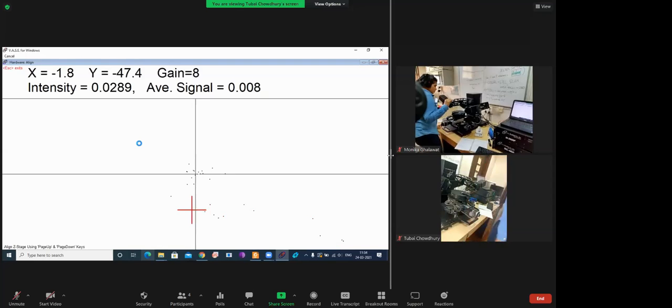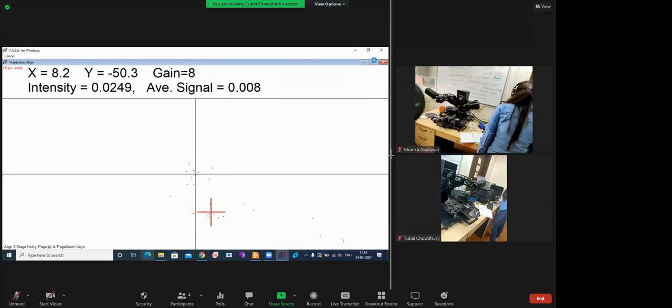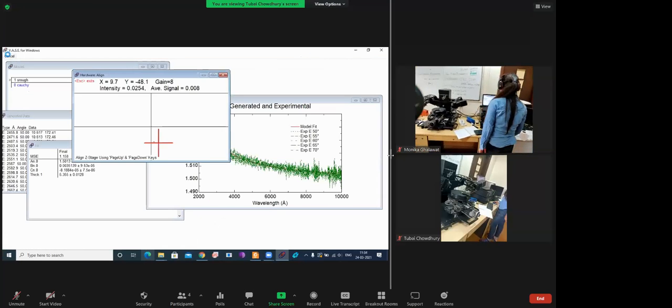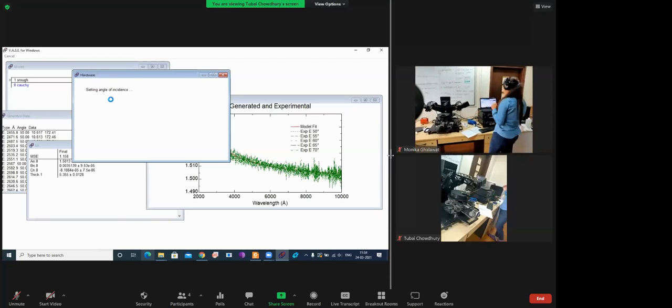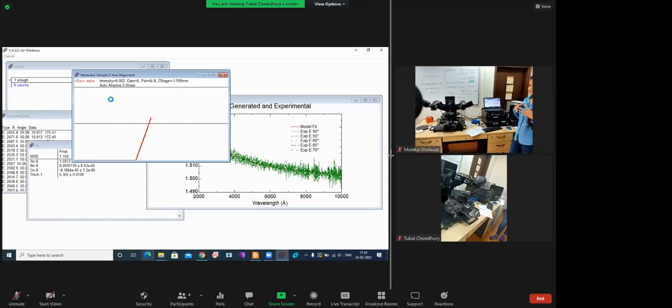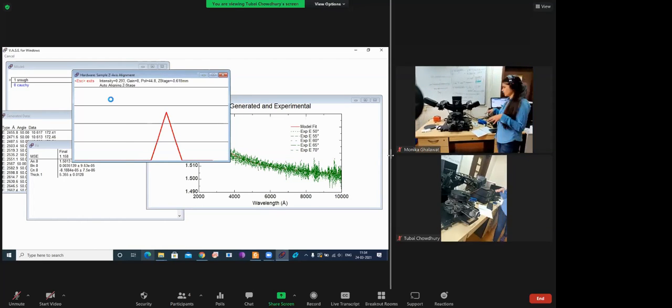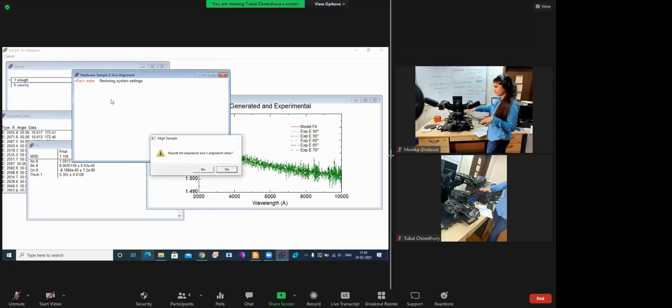Okay, if it is not aligned by this, we can cancel this and go for Z alignment. So I will change the angle and take some uniform angle, because it was at 65, 70 or 75 degree. So now I will align them.